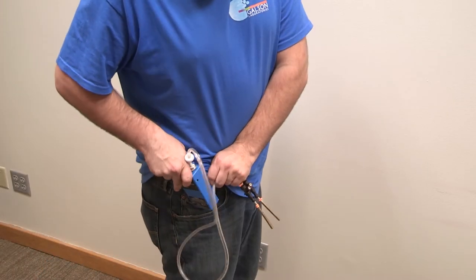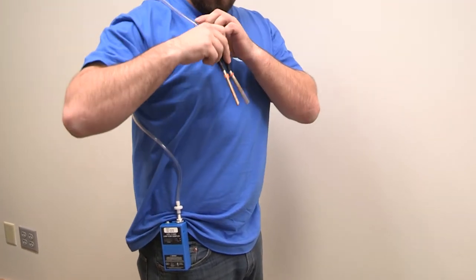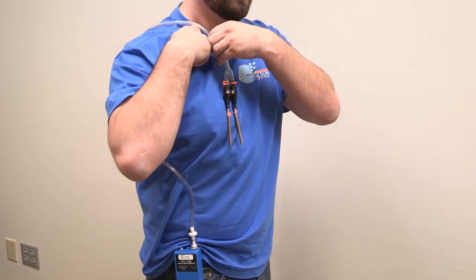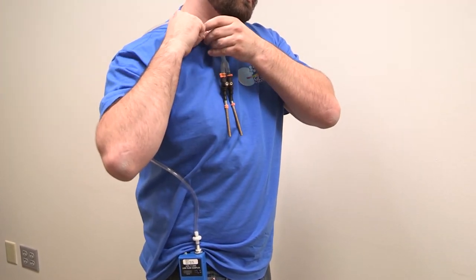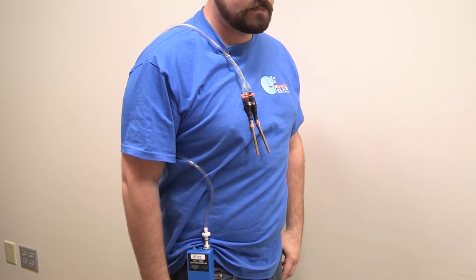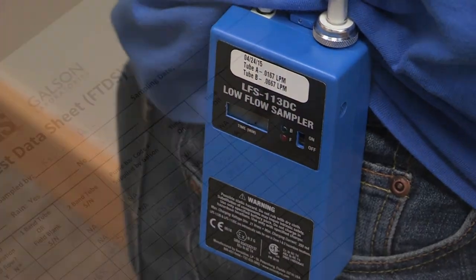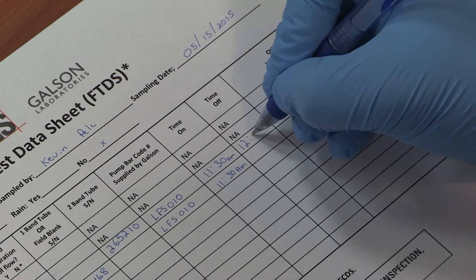Clip the pump to a belt loop and run the tubing behind your back and over your shoulder. Use the connected collar clips to secure the tubing to your person. Allow the sampling pump to run for 60 minutes. After 60 minutes, switch the sampling pump to the off position and record the stop time on the field test data sheet.